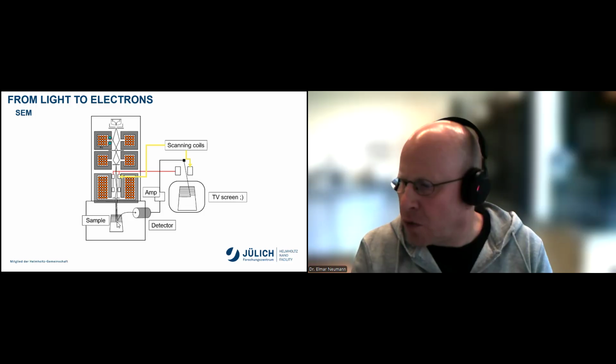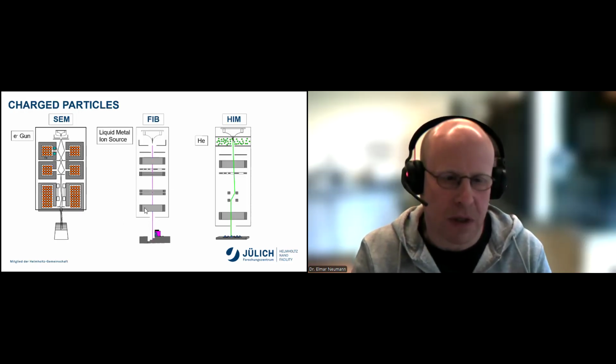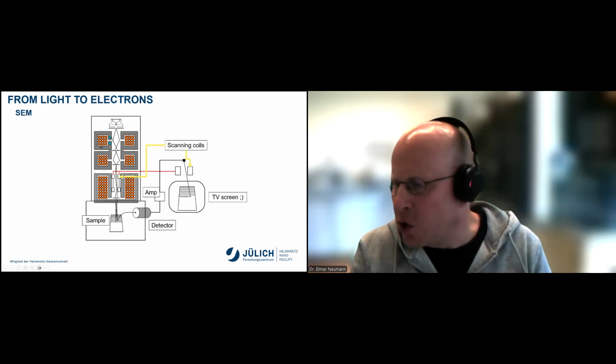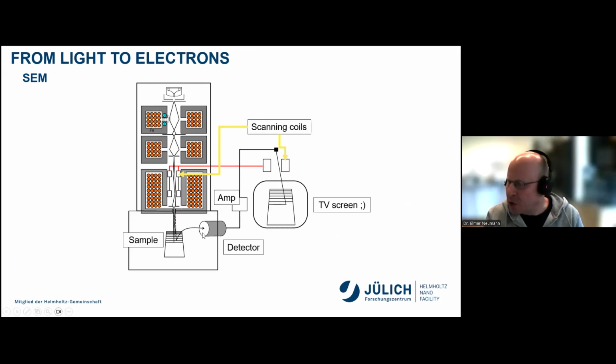The electrons that you detect come from these distinct points here. The resolution, the sensitivity for the different points, simply comes from the position of the electron beam itself.